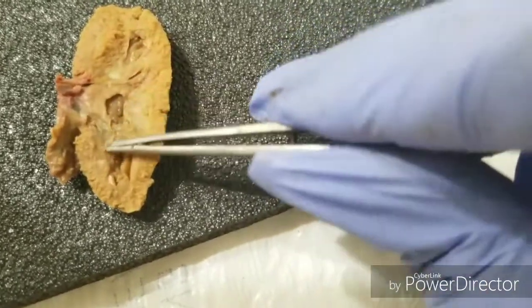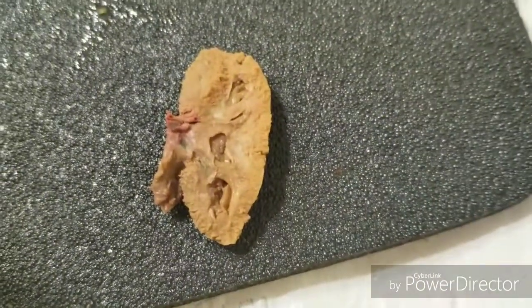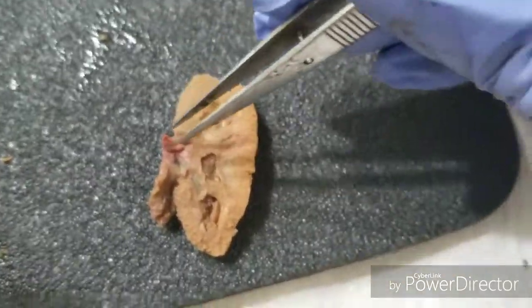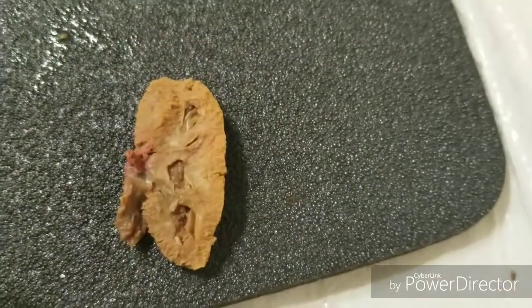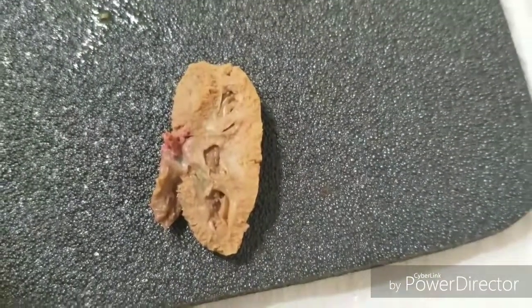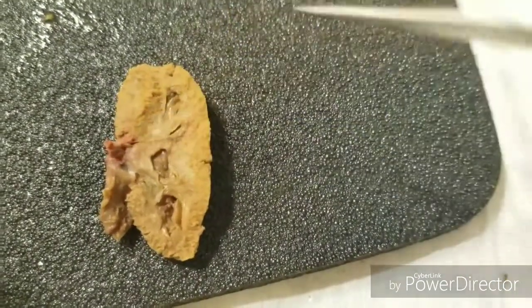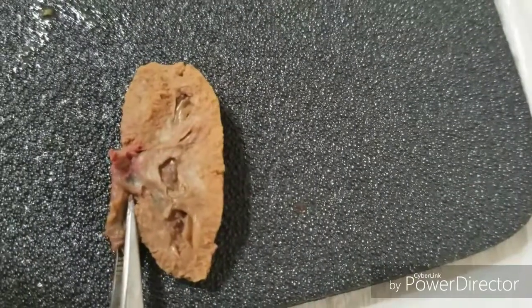Renal pyramids. Perfect. Two other structures that you can kind of see on the cross section of the kidney are the kidney artery and the kidney vein. So the kidney vein is up here. It did get cut pretty short when dissecting. We'll be able to see a better view of the kidney vein when we look at what is still intact in the pig. But for now, this is the beginning of the kidney vein going into the kidney. And so then we have the kidney artery, which is the bigger part right here, which is easier to see.